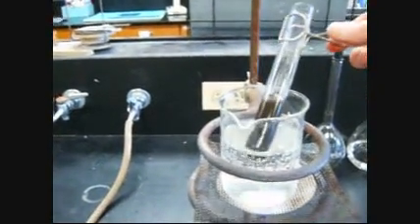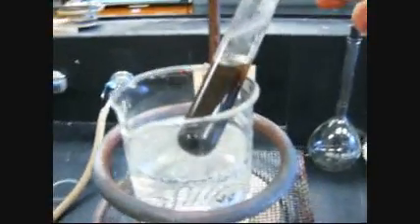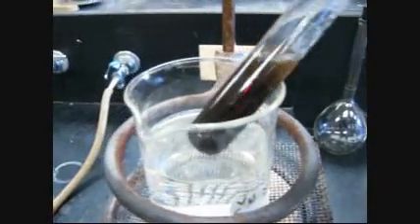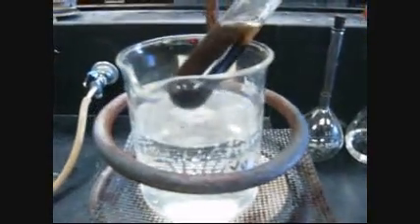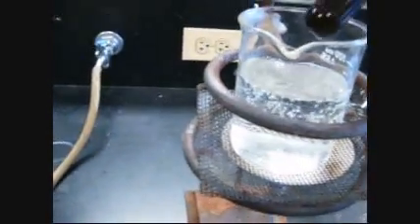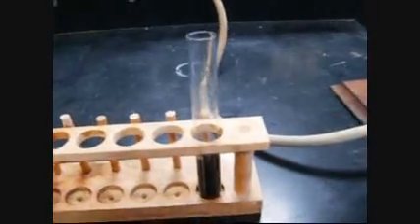Okay, now we're nearing the end of the second reaction at this point. And what we've seen here is that we don't have that blue gelatinous precipitate anymore. What we have is a black precipitate, that's black or dark brown. Okay, so we're going to take that out of the hot water bath now. Let it cool. Shut our burner off.